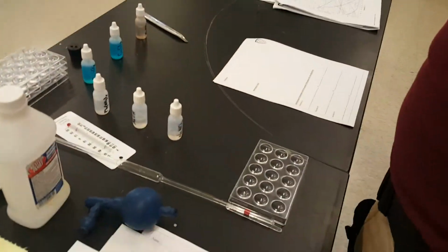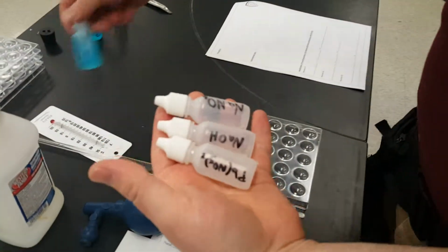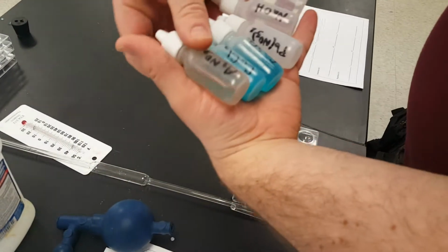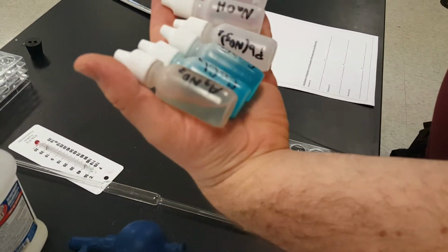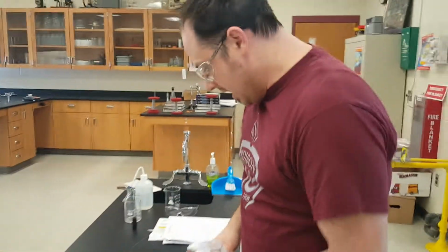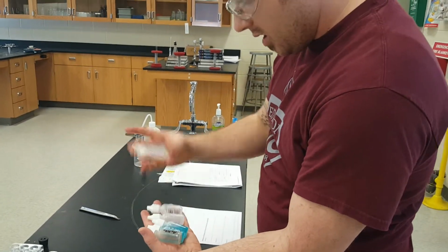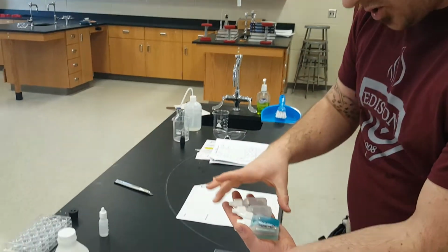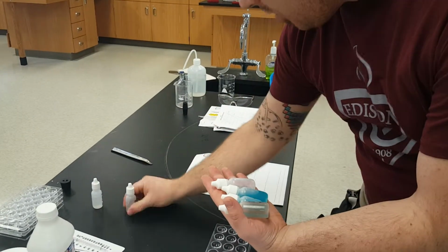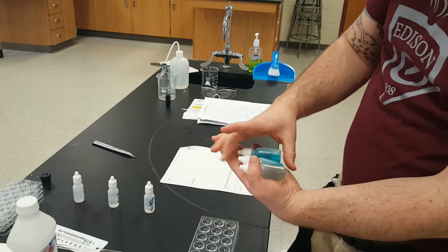Come on over. So what I've got here is aqueous solutions of compounds. I've got 6 of them. And when you go 6 by 6 or 3 by 3, there are 9 combinations. The way you combine these is very important. So I have my setup so that I am going to organize my chemicals in a certain order so that they always make the maximum number of combinations.